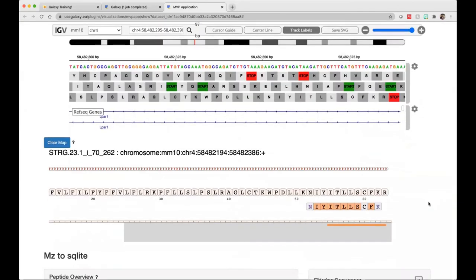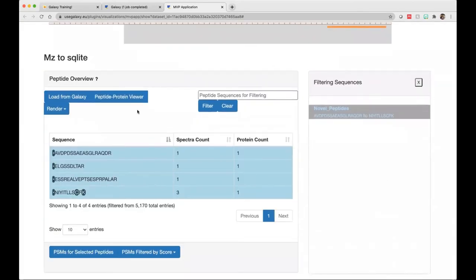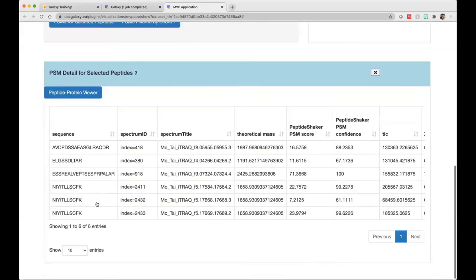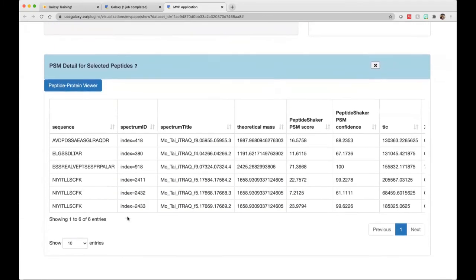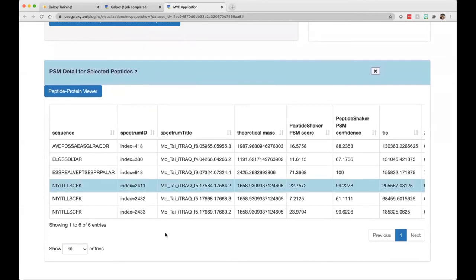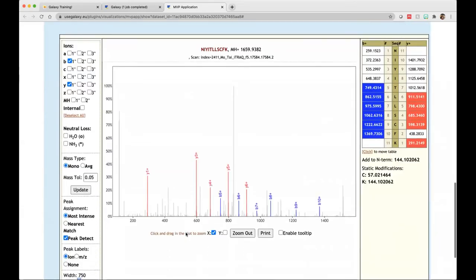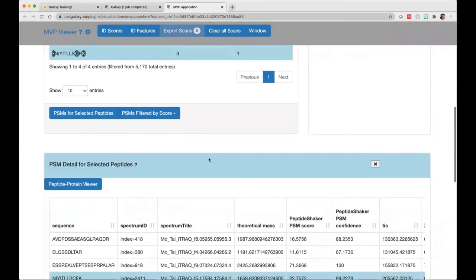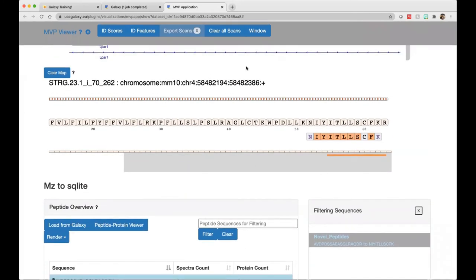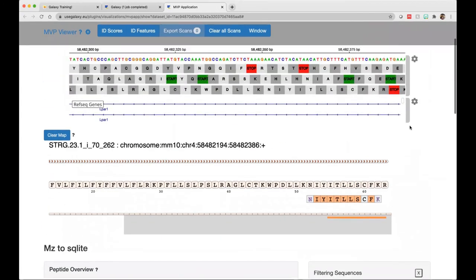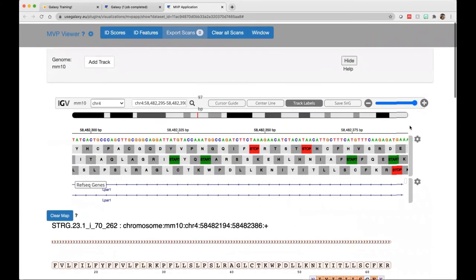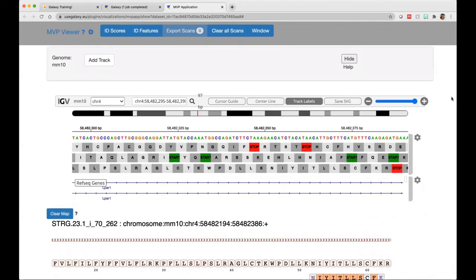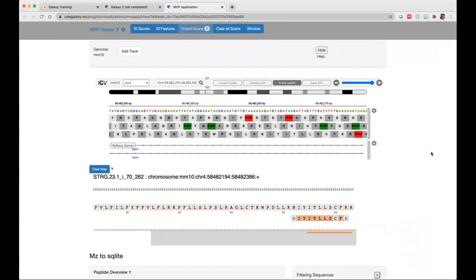This is how your MVP works. It will give you three main outputs: the peptide overview along with the PSM detail, the Lorikeet spectra of your peptide of interest, the peptide information on the reference protein, and also the IGV browser. Now that I have all the information regarding my novel peptides, I will go back to my history.